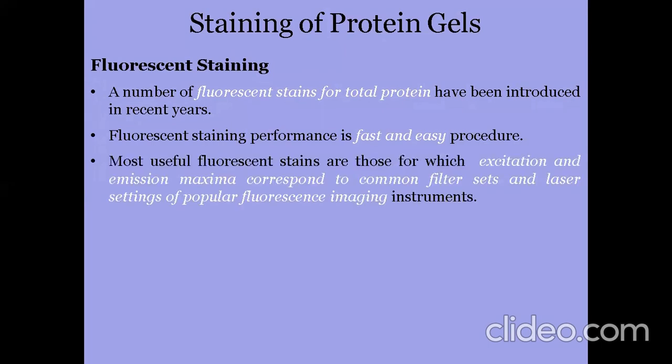Most useful fluorescent stains are those whose excitation and emission maxima correspond to common filter settings of popular fluorescence imaging instruments. We need the excitation and the emission maxima. If these wavelengths match common filters, that is more preferred because they are commonly available.